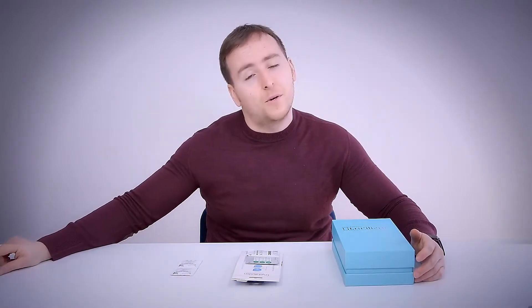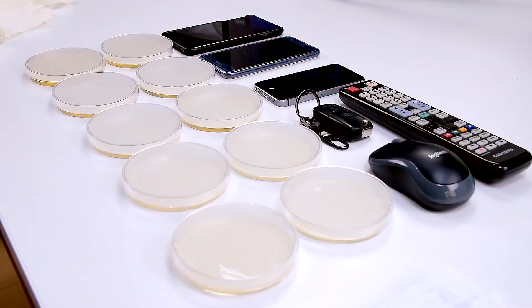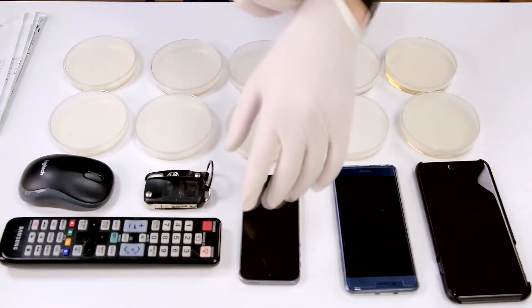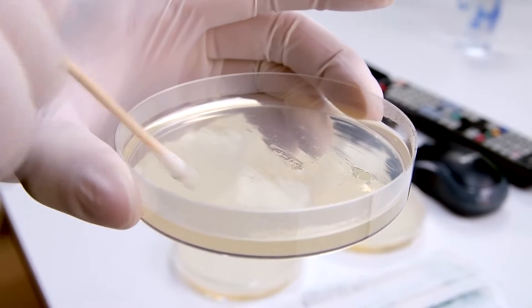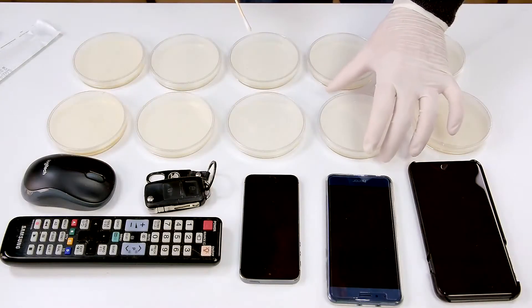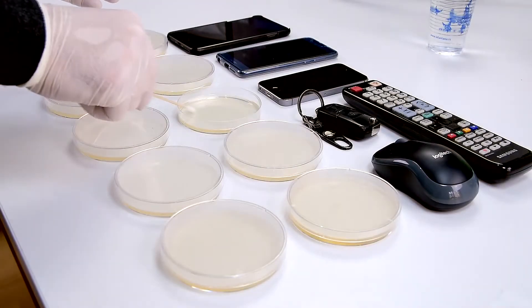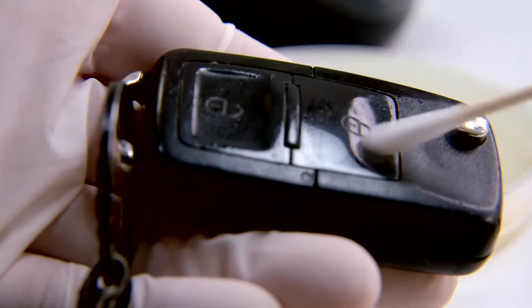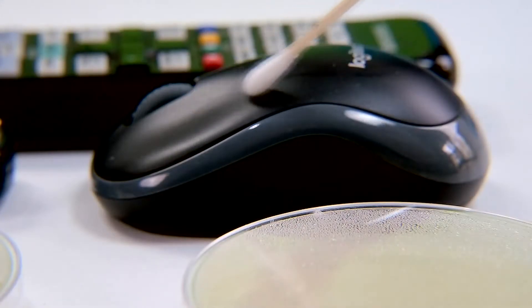So let's go to my laboratory and see what I found. In the lab, I took swab samples of three smartphones, each time using a new swab stick and a different petri dish. I also sampled a car key, a TV remote, a computer mouse, and even a toilet bowl at my office.